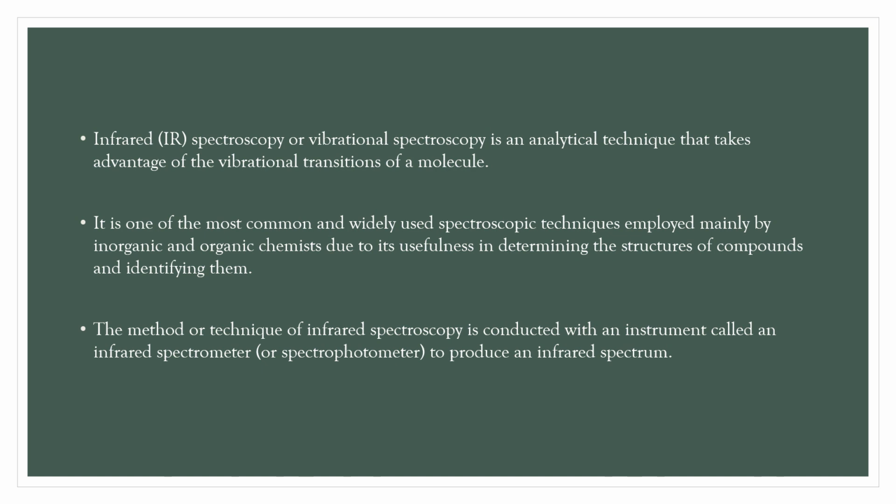Infrared spectroscopy or vibrational spectroscopy is an analytical technique that takes advantage of the vibrational transitions of a molecule. It is one of the most common and widely used spectroscopic techniques employed mainly by inorganic and organic chemists due to its usefulness in determining the structures of compounds and identifying them. The method or technique of infrared spectroscopy is conducted with an instrument called an infrared spectrometer or spectrophotometer to produce an infrared spectrum.